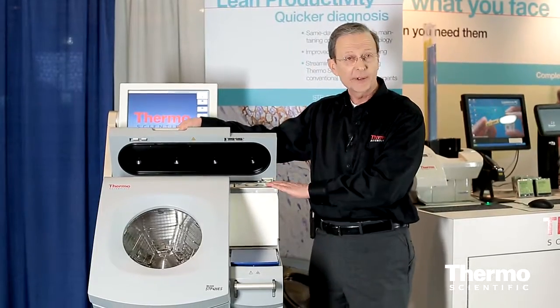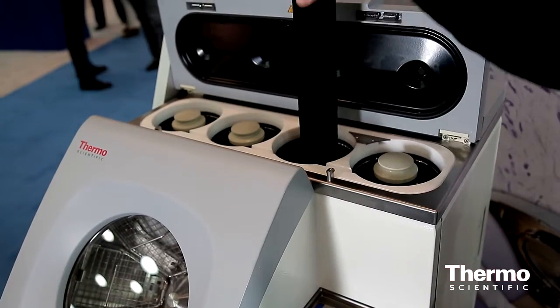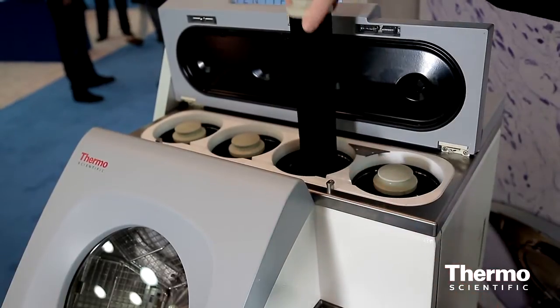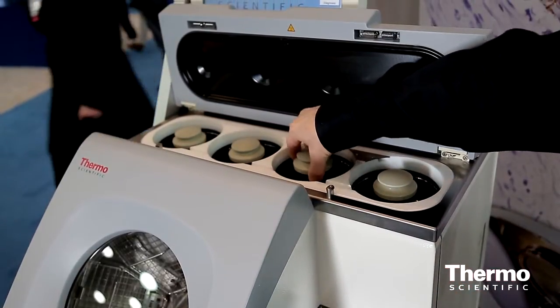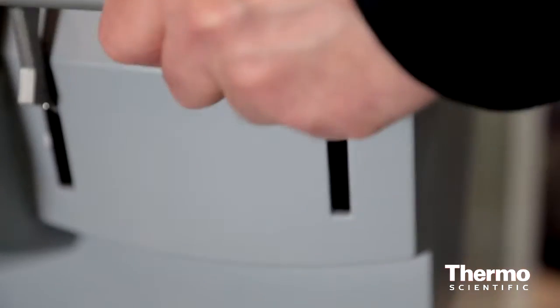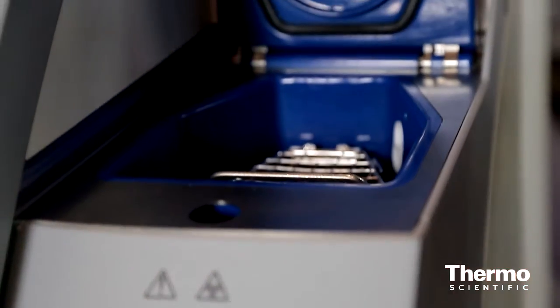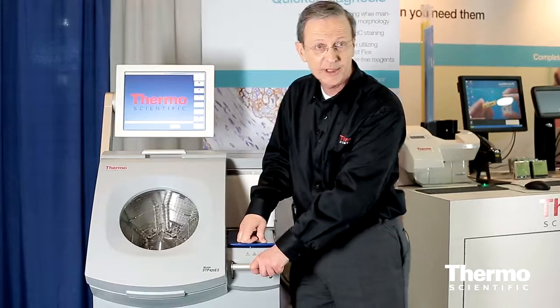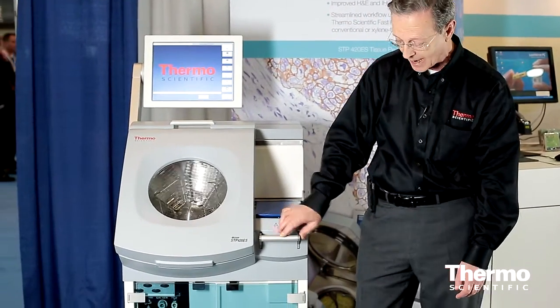Four wax baths at the top here, with an accelerated heating unit, that means that the wax melts in a reduced amount of time, and two processing chambers, which allows two independent protocols to be run on different tissue types, or the same tissue type at the same time.